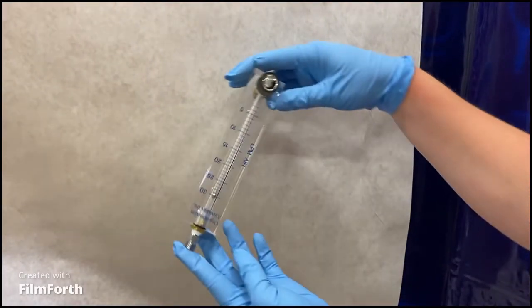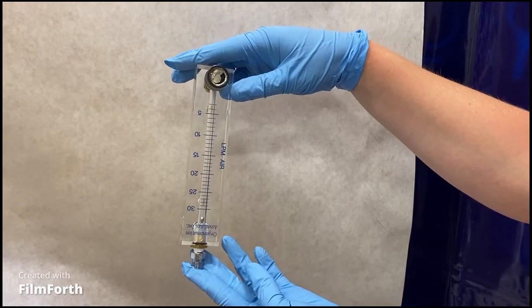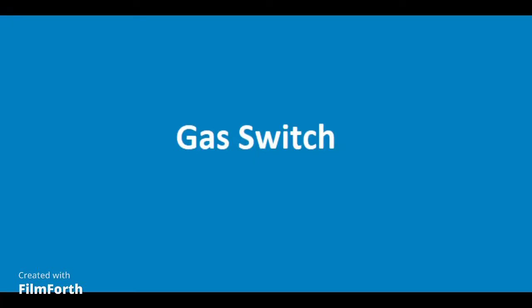To do this, disconnect the flow meter from the instrument and flip it upside down. If the ball does not move, the flow meter needs to be replaced.